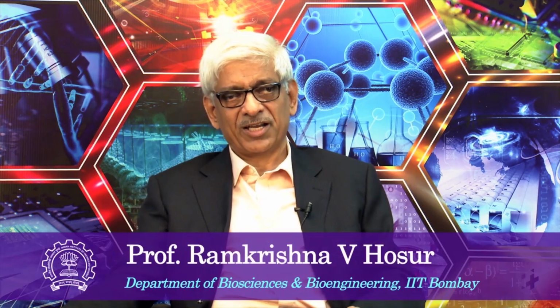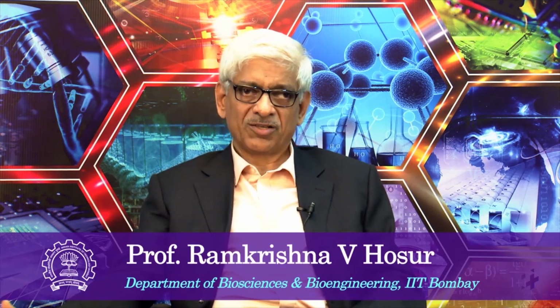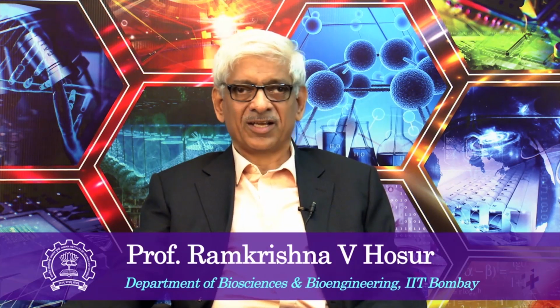Okay. So we will stop here, and the quick recap of what we have done today is the two-dimensional Fourier transformation, the theory of that one, and we have seen how it generates various kinds of line shapes, and how to optimize what we should do. What we need is an absorptive line shape along both dimensions, and we have to optimize our experiments so that we collect data in the appropriate manner and do the processing also in that manner, so that we generate absorptive line shapes along both the frequency axes. So we stop here and continue with the same in the future classes.